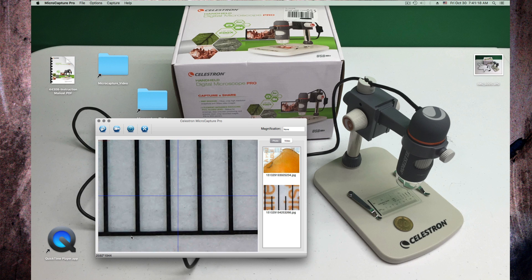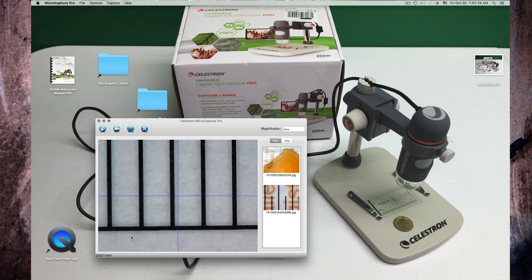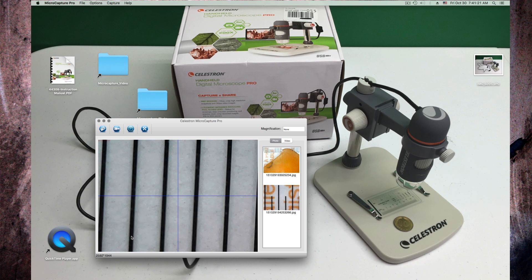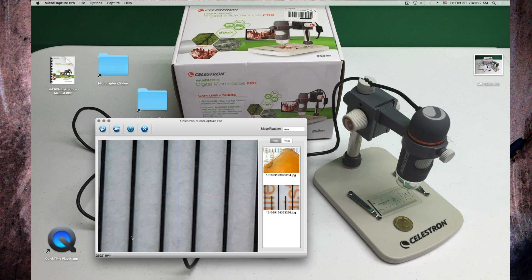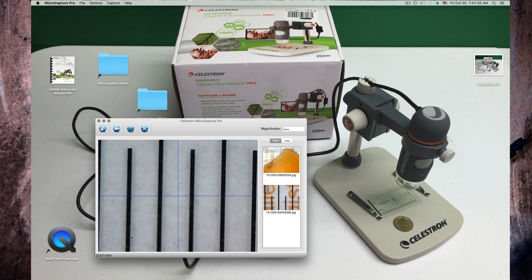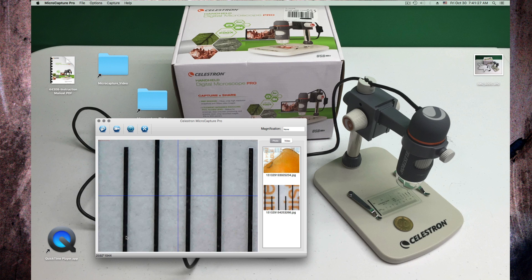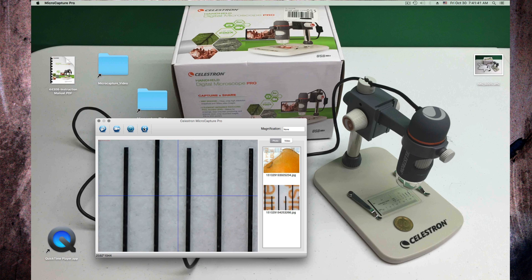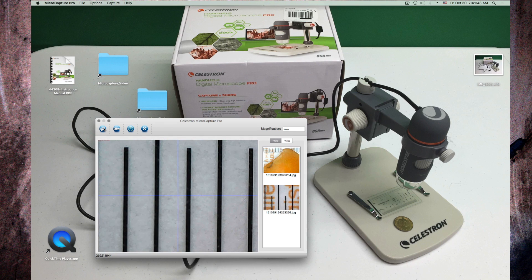Let me see here. So every line is 0.5mm, so that's good to see. This is 1, 2.5mm from left to right. Let me see how this works at full resolution. Full screen mode, exit this. And then we can take a picture.